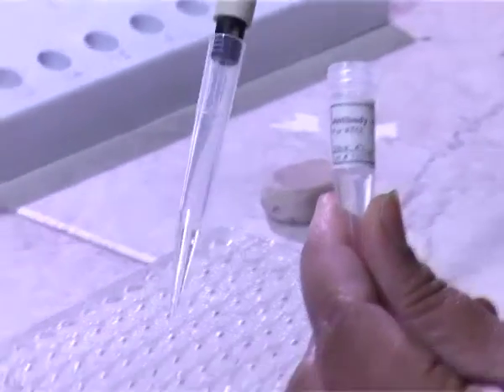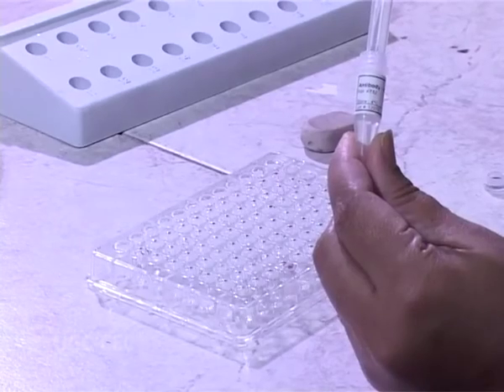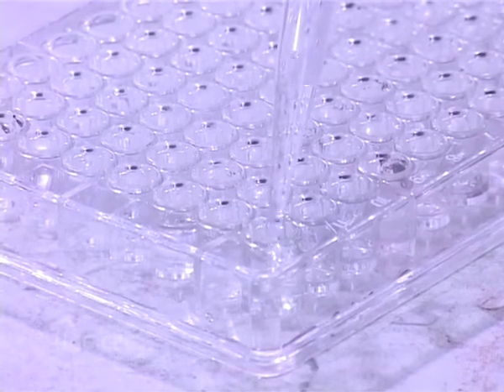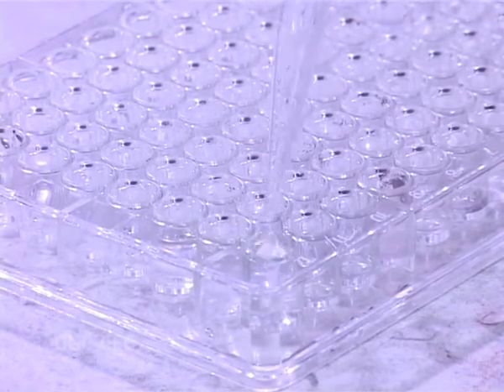Next, we will add the enzyme tagged second antibody. Remember, this is not a secondary antibody. Secondary antibodies are generated against the Fc region of the primary antibody.